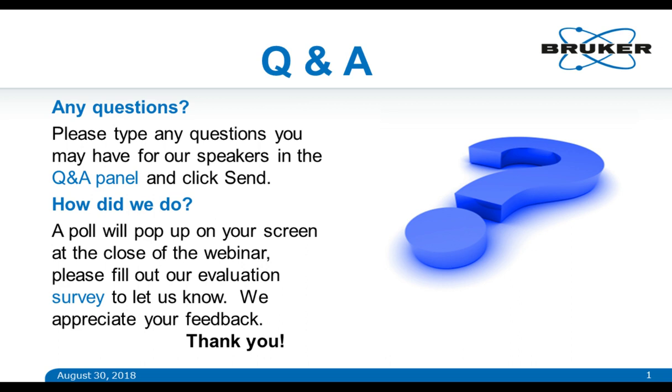So, okay, I think there is just time for one more question, and I put that to Elaine. How do you see these quantification tools impacting on clinical practice? I think now the age of precision medicine and also biobanking and high throughput screening has put us in a very good position. The technology and tools we have here will really serve the clinicians well because we can do simultaneous measurements on numerous metabolites. So I think now is the perfect time to marry metabolic profiling with real clinical practice.